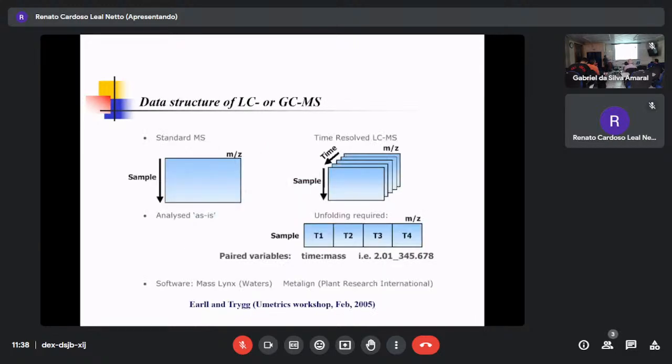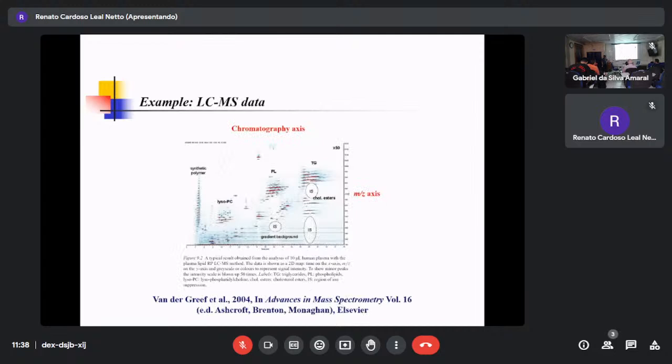So really basic, the processing of the sample data looks like this one. Here, your data, sample, and then retention time is here. Yeah, they take it out.